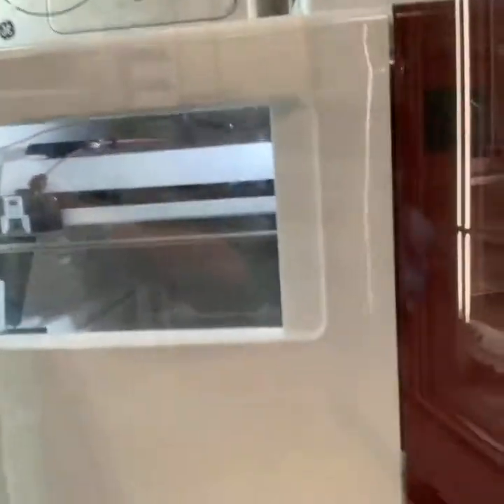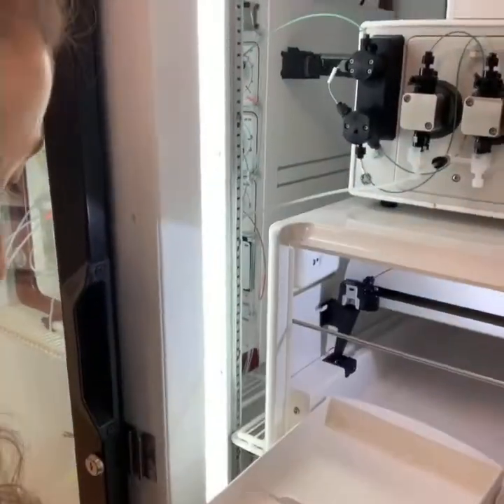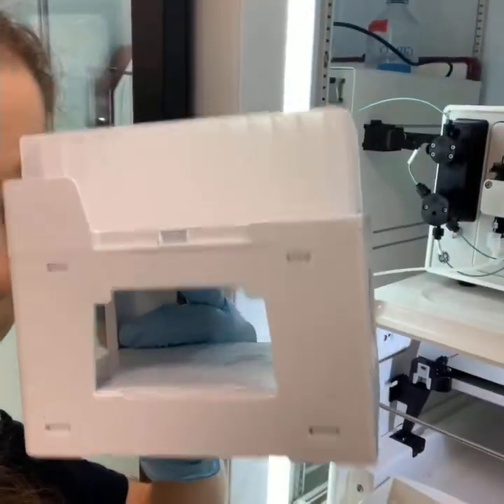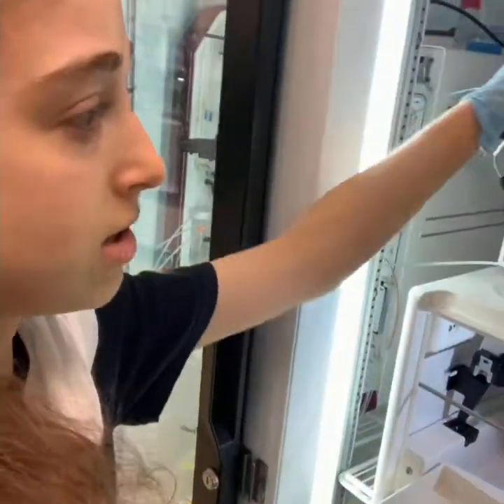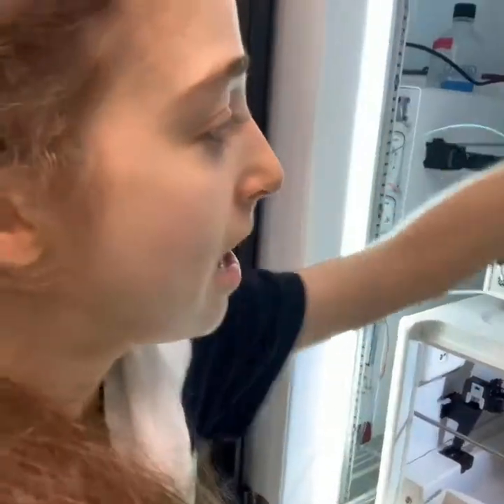So when it's coming out of the column, it's sent through into this fraction collector. And so the fraction collector has this tray and it has these different inserts you can put in. So I used this 96 well block, a deep well block, because I wanted small fractions. But if I want bigger fractions I can use the tubes.